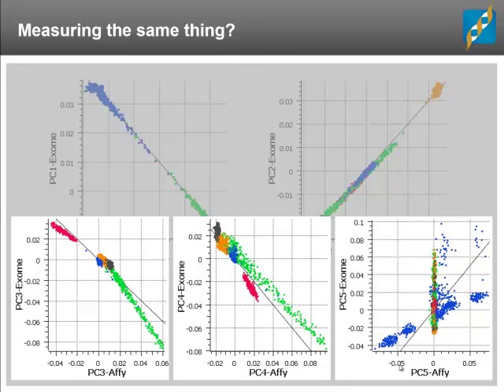Within SVS, your best option would be to use the KBAC, so the mixed model KBAC, where you can incorporate a kinship matrix to the analysis. What it will do then is correctly adjust the test, recognizing that some samples with the same variant happen to be related to each other, although it won't necessarily incorporate any kind of transmission or linkage information there.